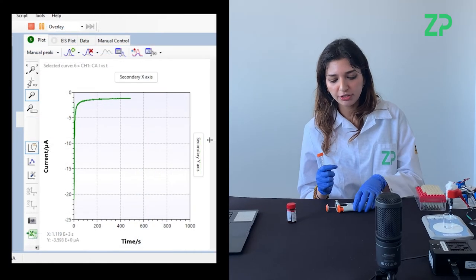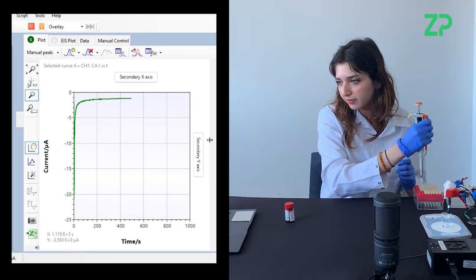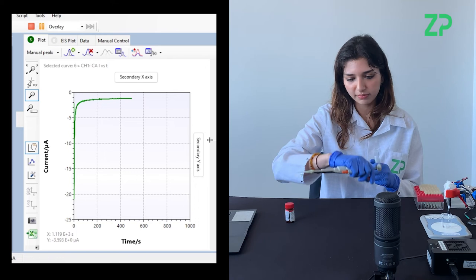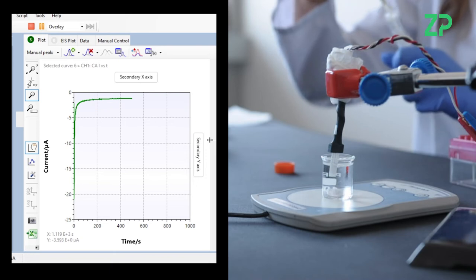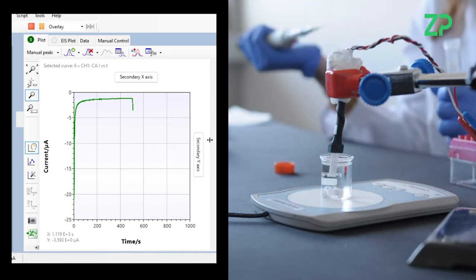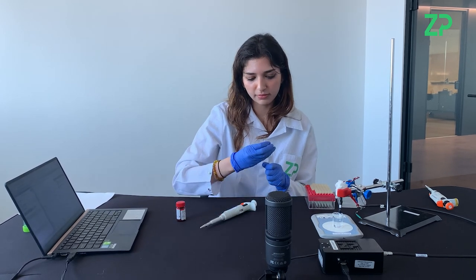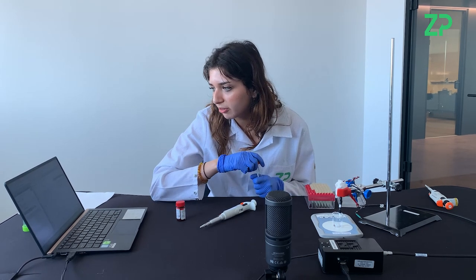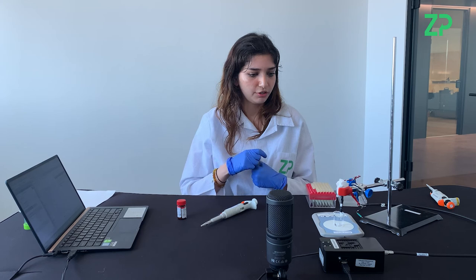Now we'll get ready to apply titrations of 20 microliters — we're almost at 500 seconds. So I'll apply it now. As you can see there was a step at 500 seconds, which was our first titration. From the graph there was a step down, and you will apply these titrations every 100 seconds to get your calibration of your lactate generation 2 sensor.